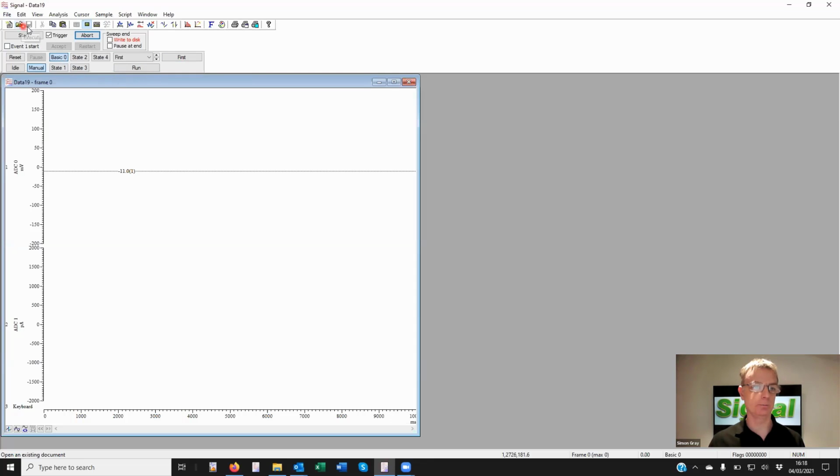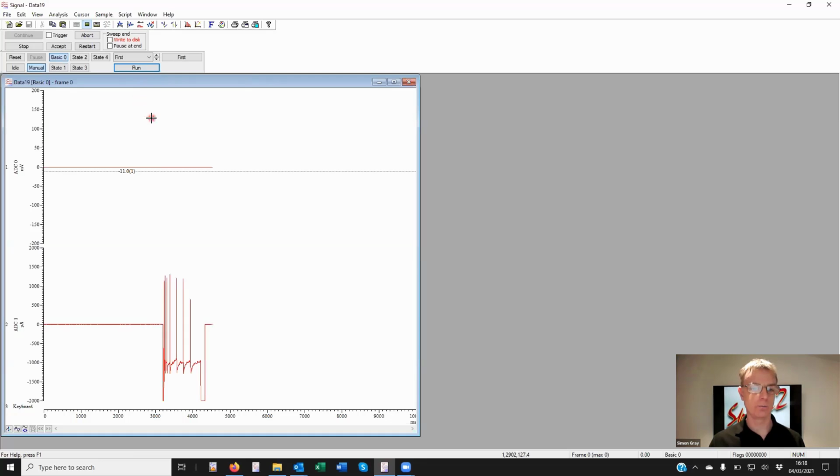So when I'm sampling, I don't have anything particularly exciting in my states, but going through the second protocol might not have any impact because it's not obvious what state. No, that it shows it here. I think they're all the same as state 2. But that's how you would select your protocols and change protocols if you wanted to do that whilst you're sampling.